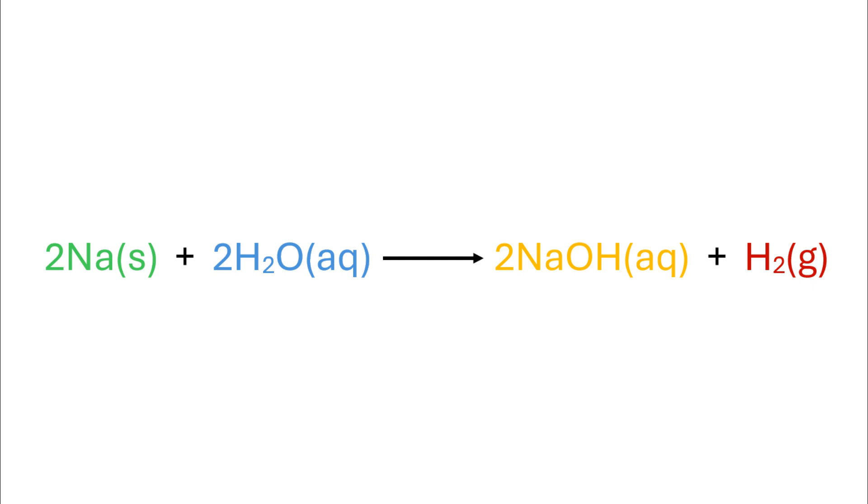The smoke-like gas produced from the surface of the metal is hydrogen gas. The reaction also produces copious amounts of heat, so much so that the hydrogen gas, which is a highly flammable gas, may also ignite and the sodium metal appears to catch fire.